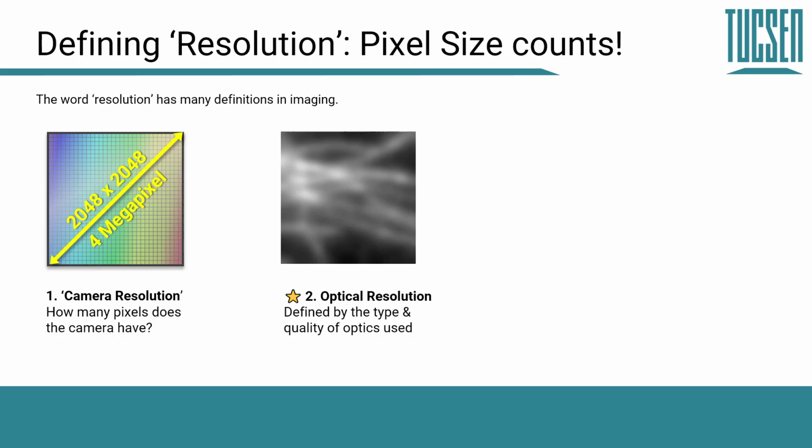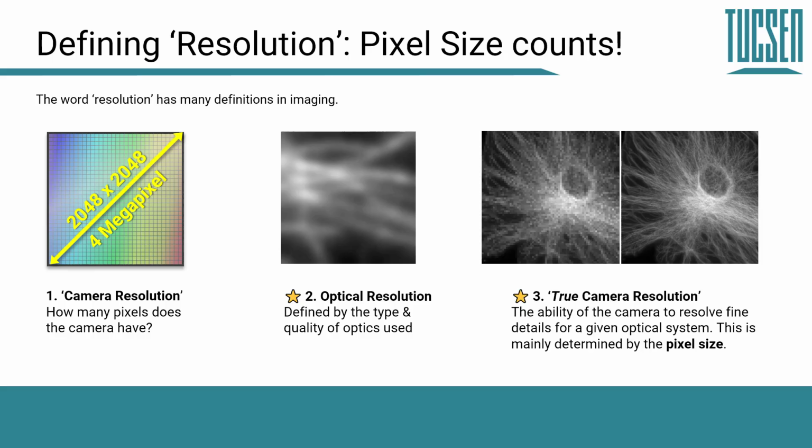This is a really important factor. And this is defined by the type and the quality of optics used, as well as quantities like the wavelength of light.